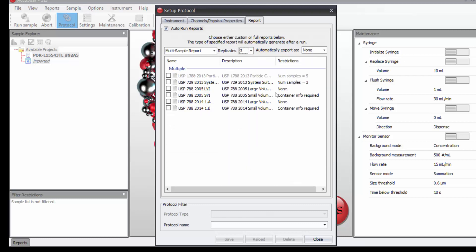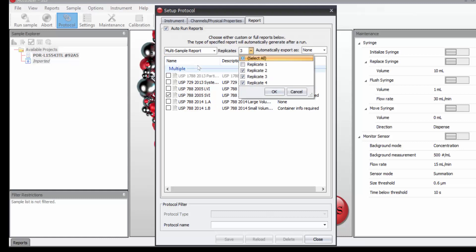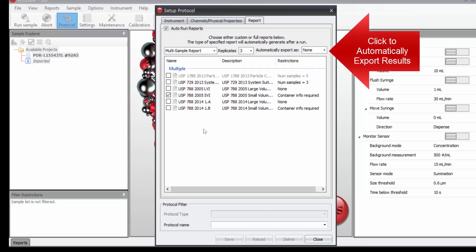And now if I click here on running the report, now it will automatically run the USP SVI report at the end of the measurements.